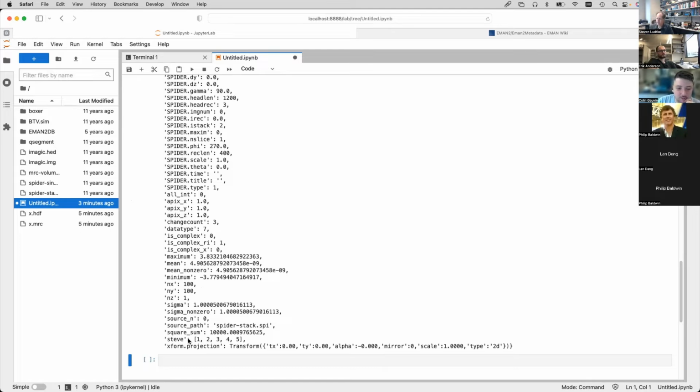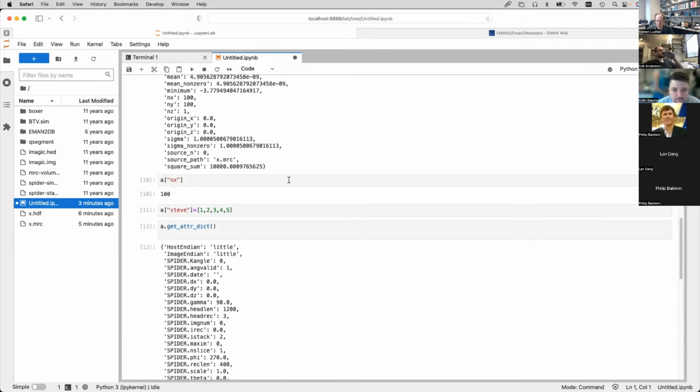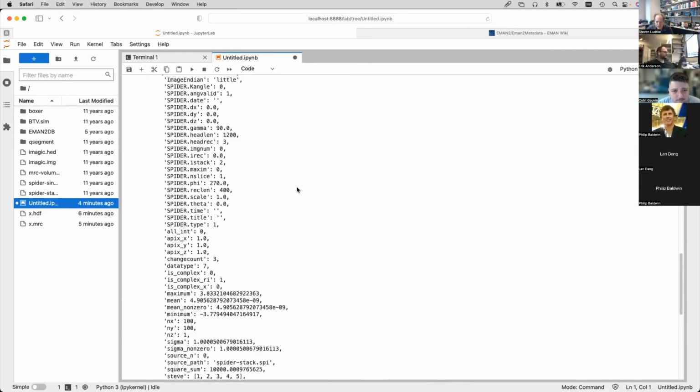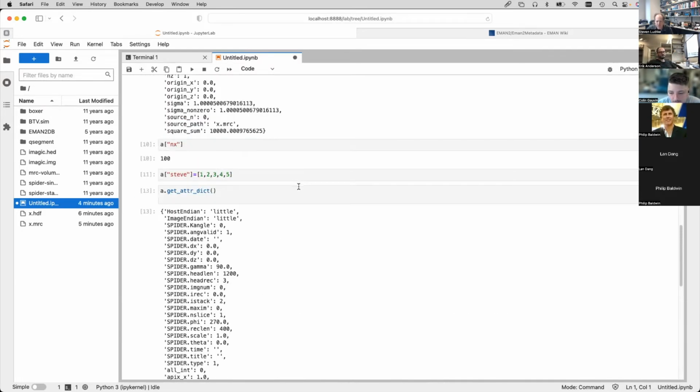EMAN would probably accomplish the same thing, and I can script it. You'd have to look at the header to try and figure out exactly what's causing it to crash, but yeah, the situation you're describing certainly isn't unique.